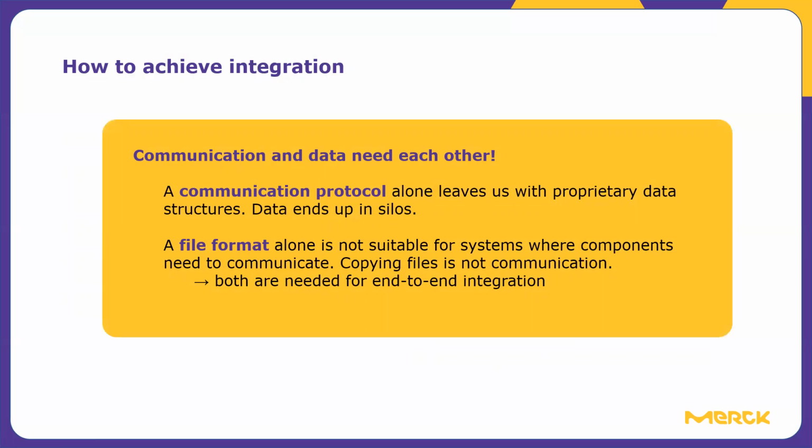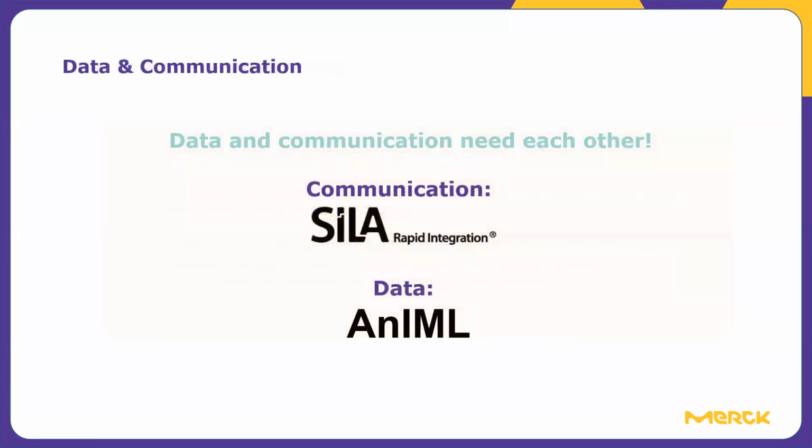An open and interoperable standard file format is also interesting. However, a file format alone is not suitable for systems where components need to communicate, because at least according to my book, copying files and moving them around is not communication. But if we combine the two, an open communication protocol and a standardized file format that is able to describe the data that I'm handling in the lab, I have what I need for end-to-end integration. And that's what this is about.